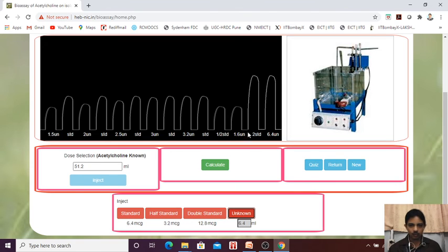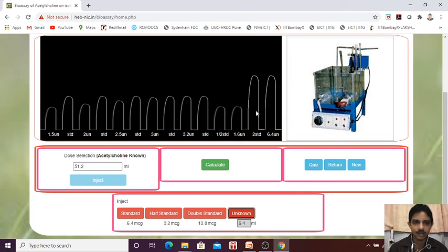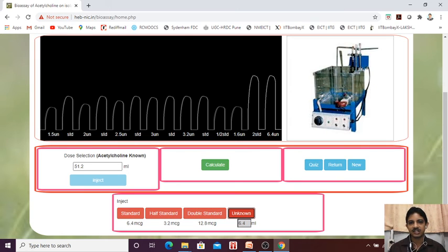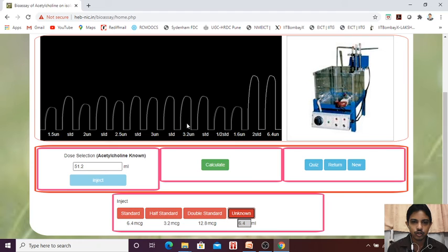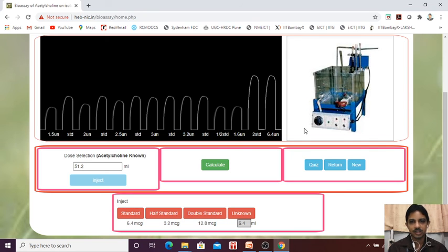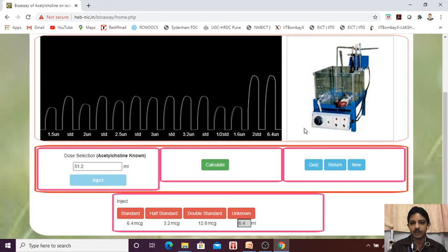What is our result? Our result is we are increasing the concentration until the two responses matching. So here we got it. Here we got the, you can say that, this is the end of our experiment. Next will go for the calculation.